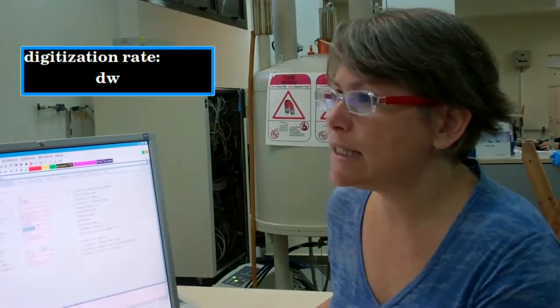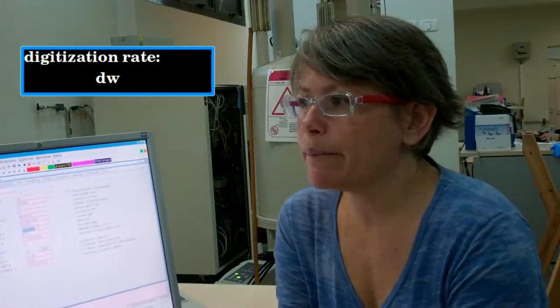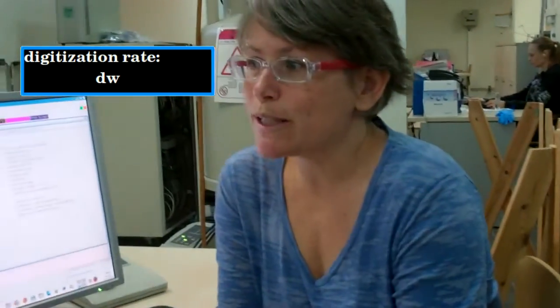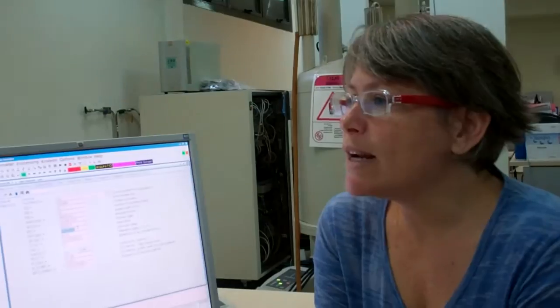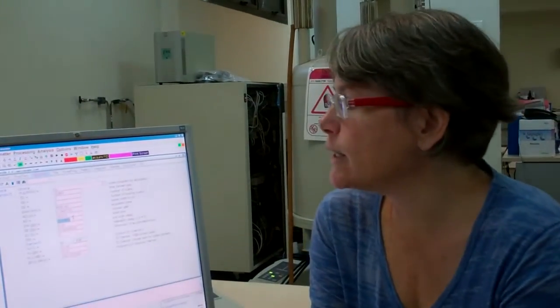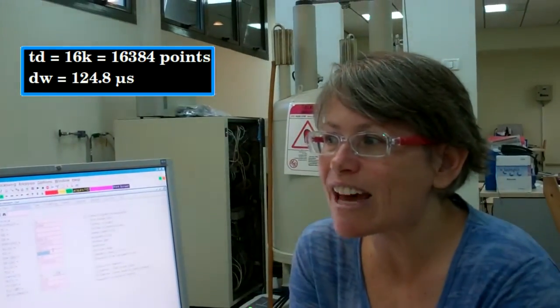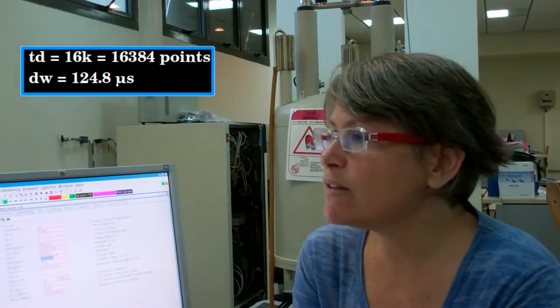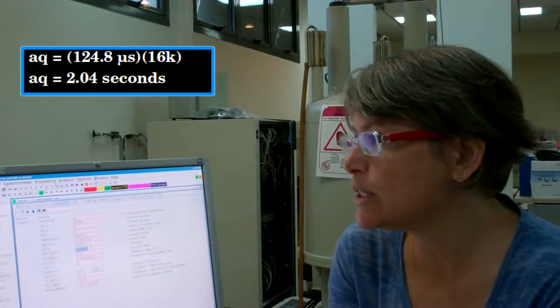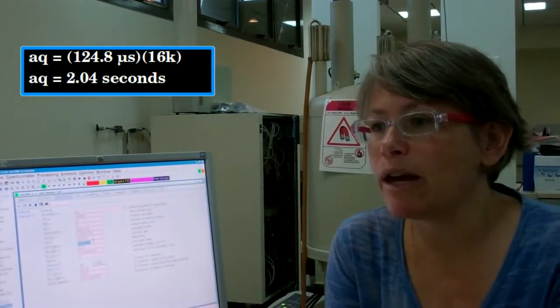Next on our list is DW, our dwell time, which is set by 1 over twice the spectral width in hertz. Right now, it's 124.8 microseconds. That's the time interval between each of the 16,000 data points, which gives us a total acquisition time of 2 seconds in order to record the FID.